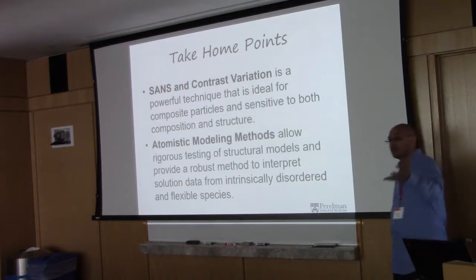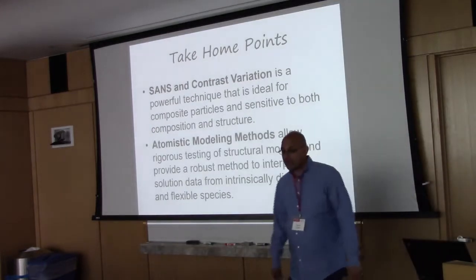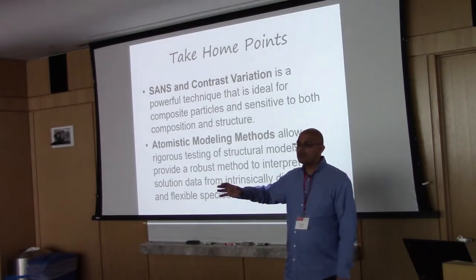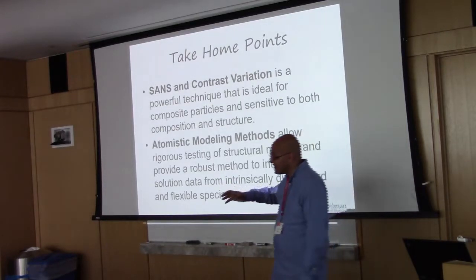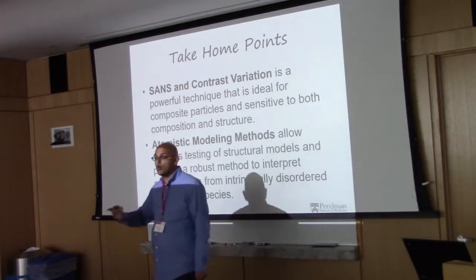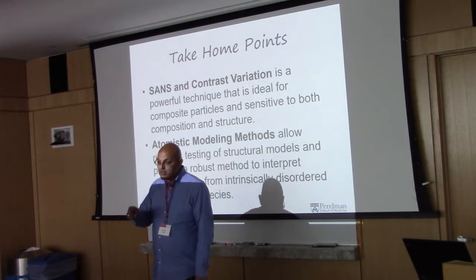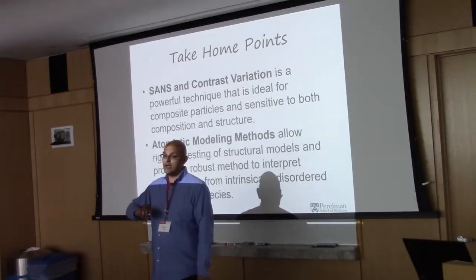All right. Contrast variation. Papers on SAXS using macromolecules come out at a clip of about 1 to 2 per day in PubMed. Whereas in neutron scattering, papers come out at a clip of about 1 to 2 per week, on macromolecules. There's a reason for that, but contrast variation is very powerful.